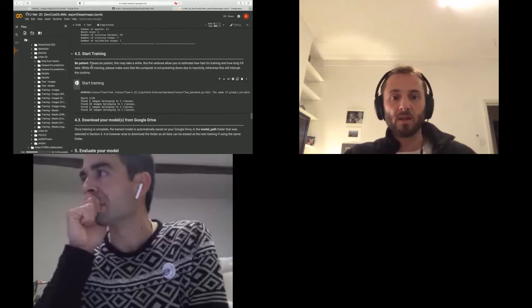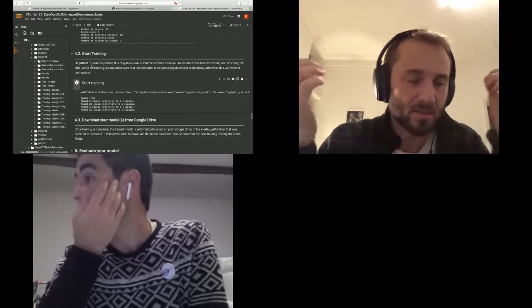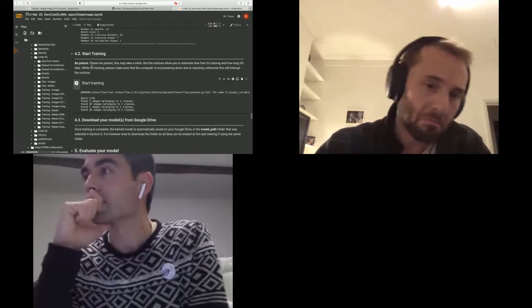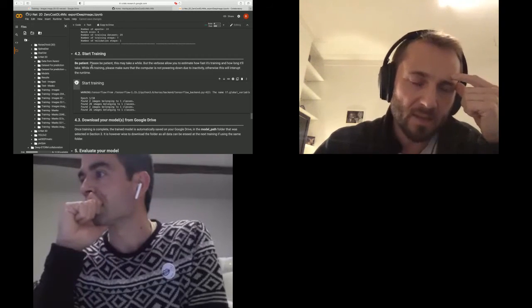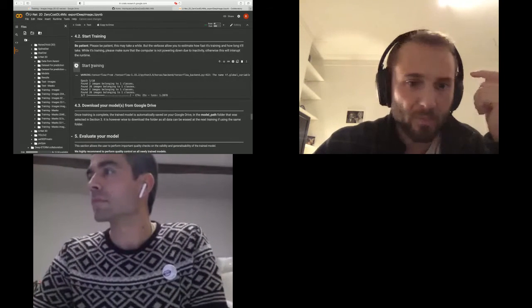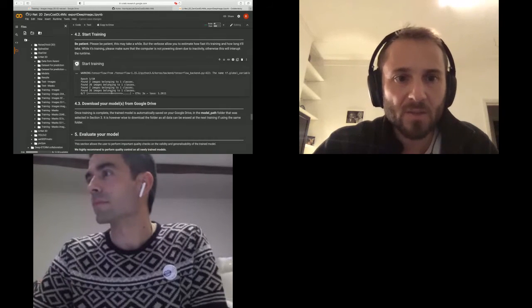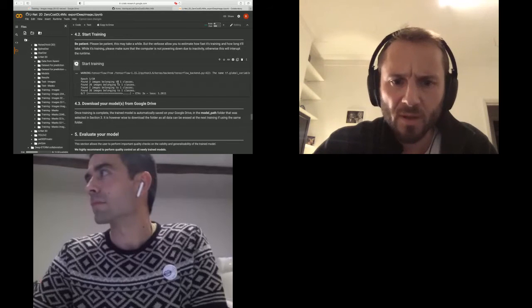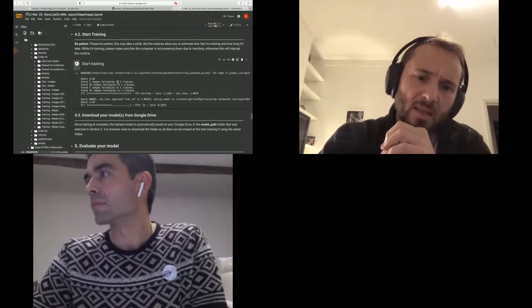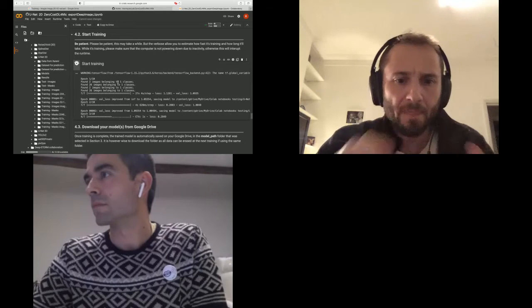We are training a state-of-the-art neural network for bioimage analysis, online with 10 clicks, and completely for free, right? I've not paid anything to be where I am today, and because I've only set up a handful of epochs, it'll only take 1 or 2 minutes.